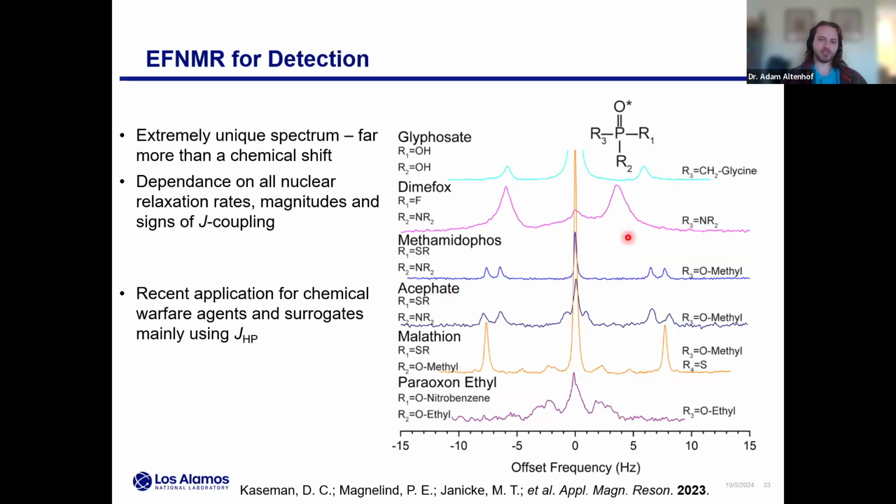So to show a previous example of how this was used for detection, again, from Derek Caseman, this initial work was funded to see, could they use Earth's field NMR to do meaningful sample differentiation on chemical warfare agents? So we're talking about things like sarin gas, where you basically have this sort of central building block of this phosphate group. And what Derek's done here is he's used different functional groups on this main block, and he's just trying to see, is the J coupling between proton of those ligands and that phosphorus going to change in every case? And, how sensitive are we to that?